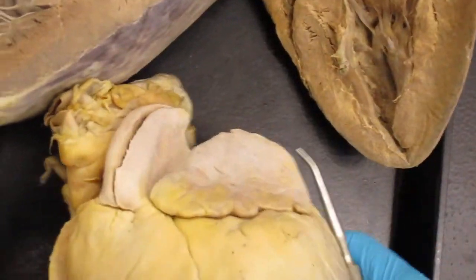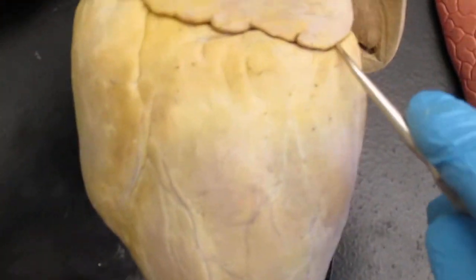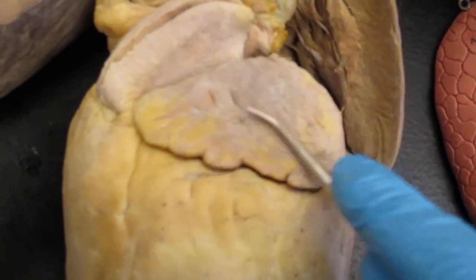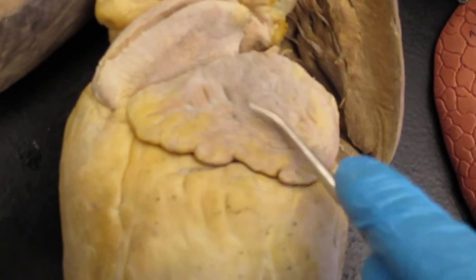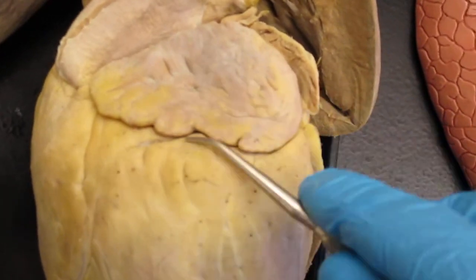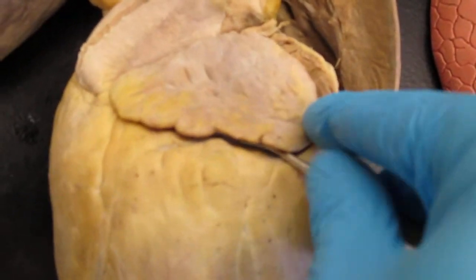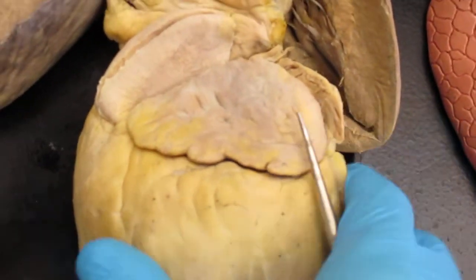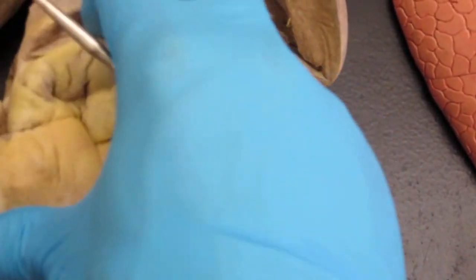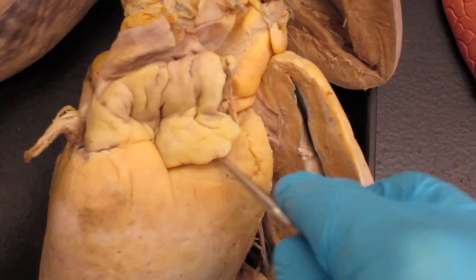Okay, let's flip this around. We have a structure right here. This is your left auricle. It looks like a dog's ear. It's going to cover up the left atrium. Right here we have this structure, which is the coronary sulcus. We have this on the other side. This would be the right auricle right here, and then you would have the coronary sulcus here.